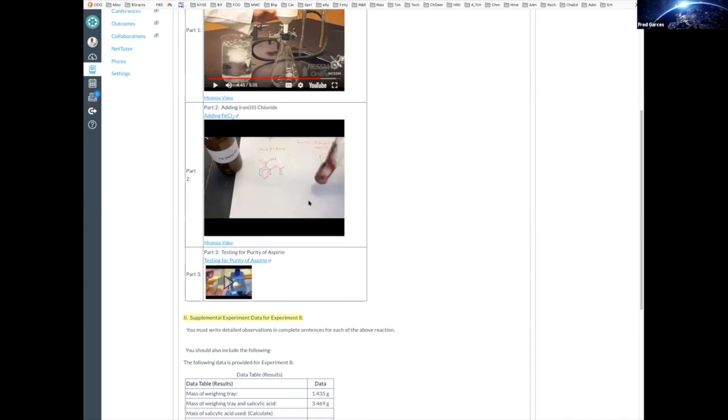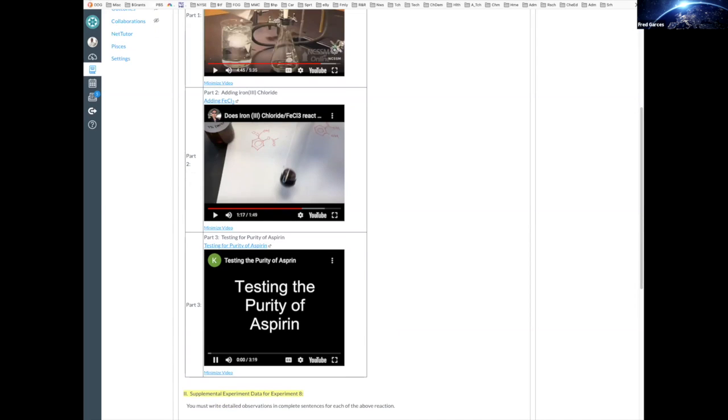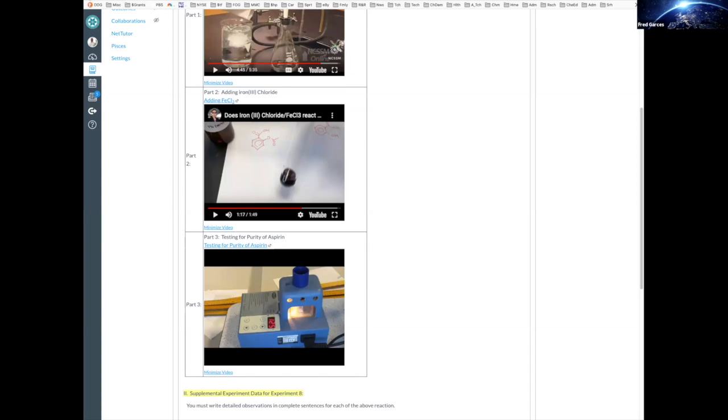Finally, this particular video, and these videos are not long. The first one is 5 minutes, the second one's less than a couple of minutes, and then the last one is 3 minutes. This machine is going to check the purity of aspirin. So watching these videos is less than 10 minutes, okay? As opposed to 3 hours in lab.